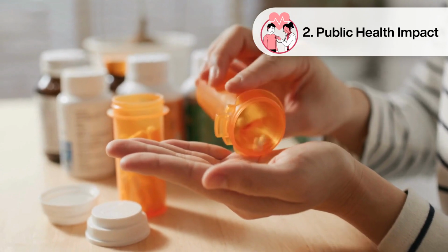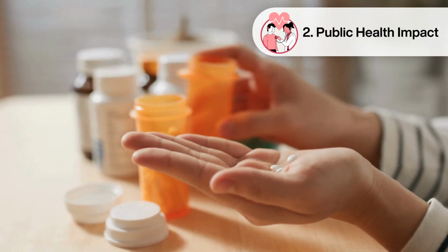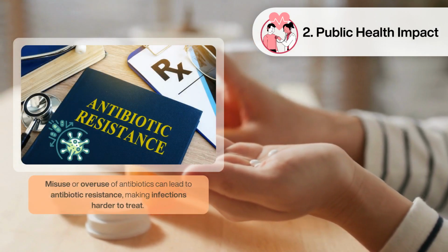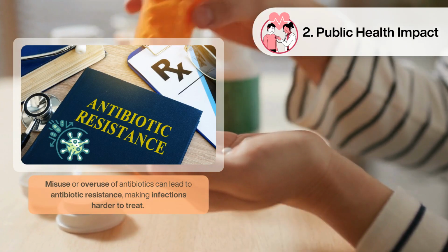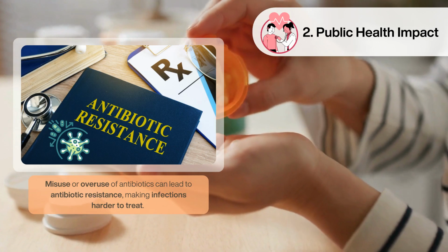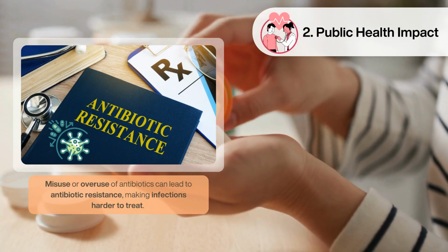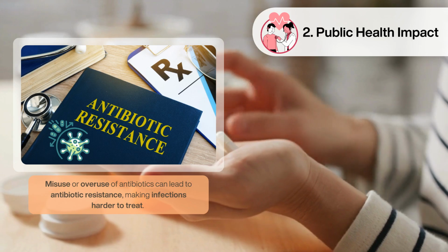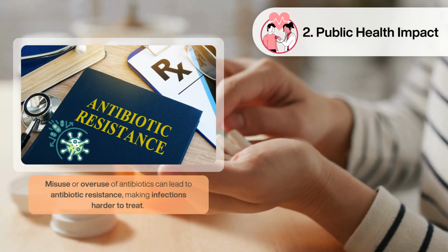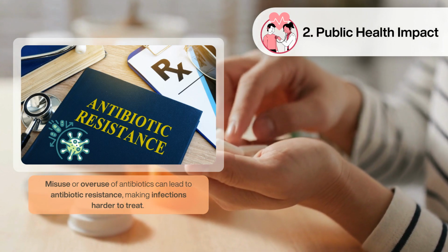The knowledge of how antibiotics and disinfectants work is crucial for public health. Misuse or overuse of antibiotics can lead to antibiotic resistance, making infections harder to treat. By grasping the principles of how these drugs interact with bacteria, you're better equipped to understand the importance of using antibiotics responsibly. This practical not only educates you about microbiological techniques, but also raises awareness about global health issues like antibiotic resistance.